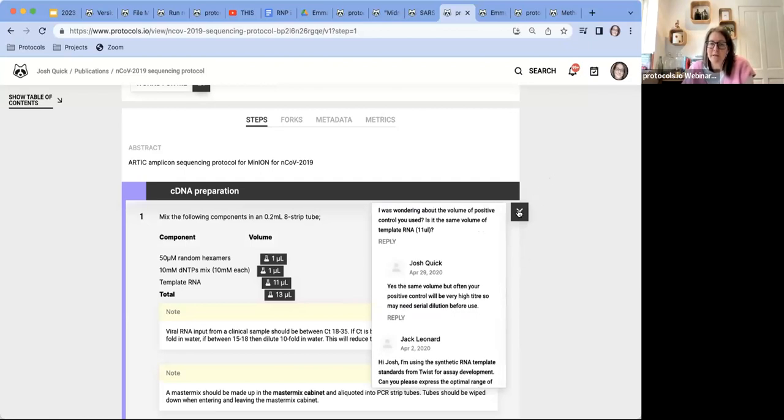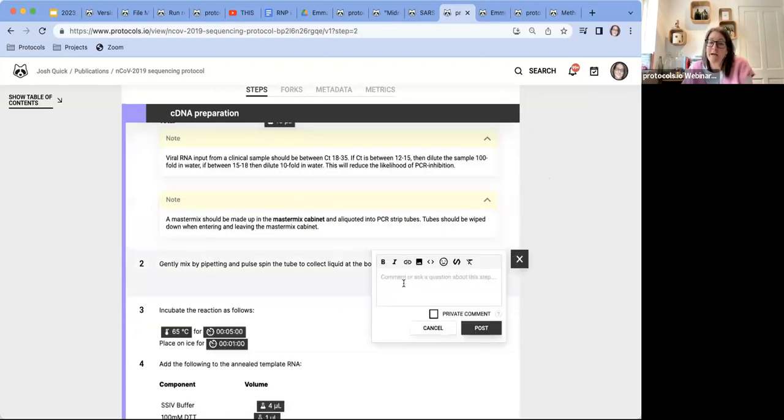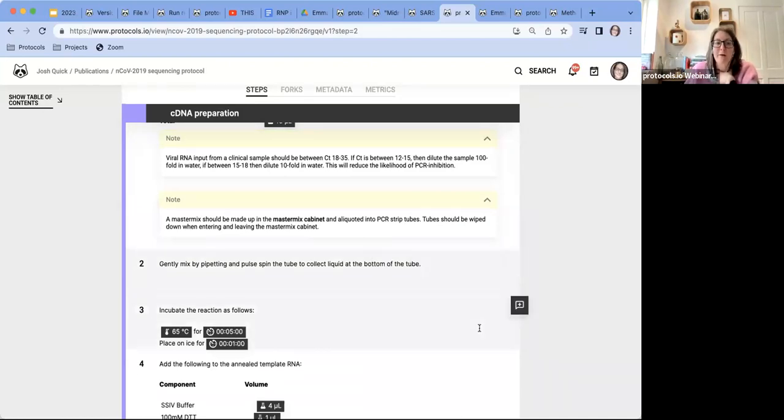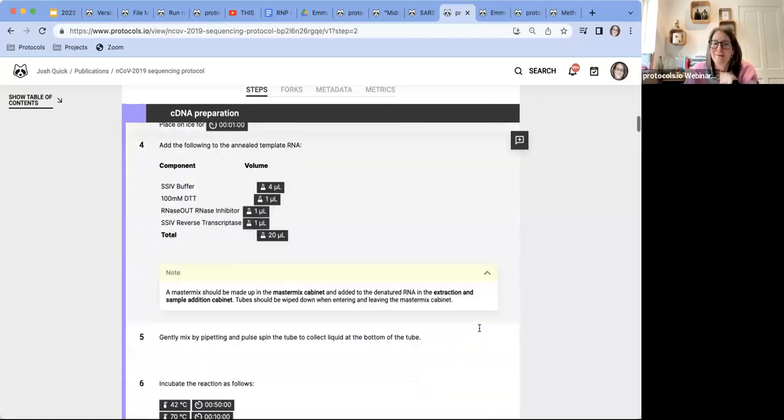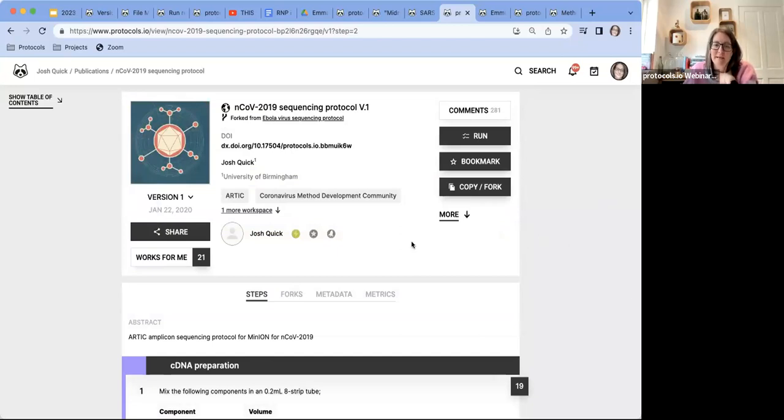So if I wanted, I could add a question here, ask my question. We encourage people to do this publicly, obviously, because then other people can see it. And I would post it, and Josh would get a note saying someone's added another comment to your protocol, and he can come and respond if it needs a response. I won't do that now because he's got enough to do with one of his own protocols already. But you then have this amazing ability to go back and look at the questions and answers.